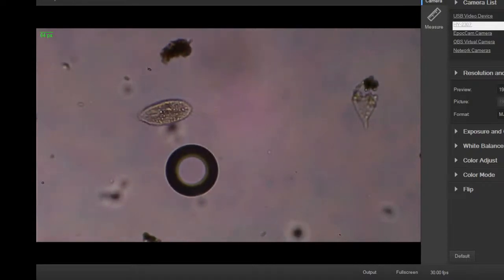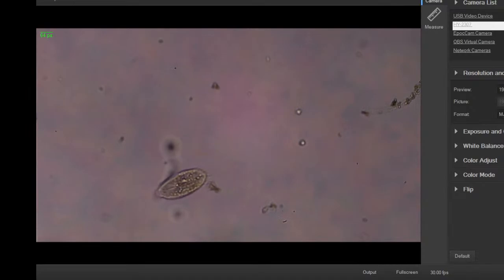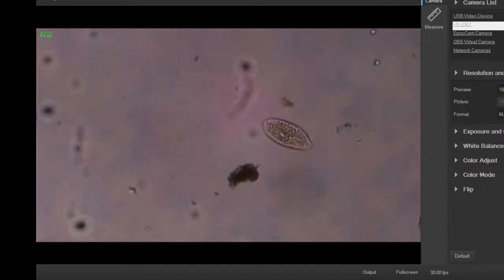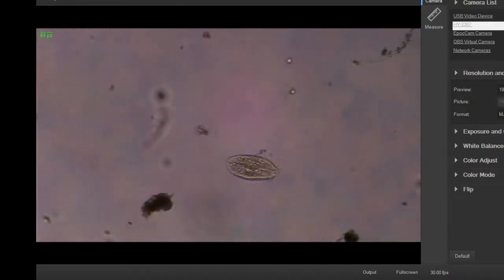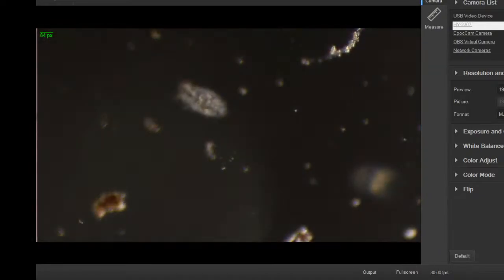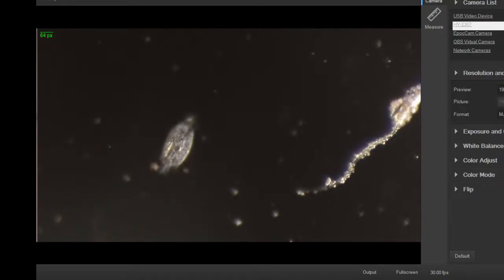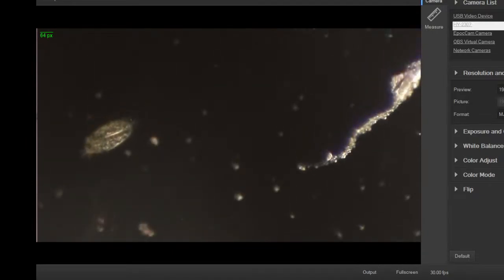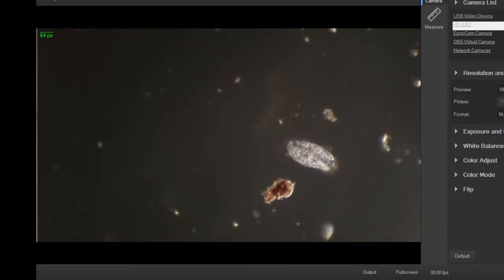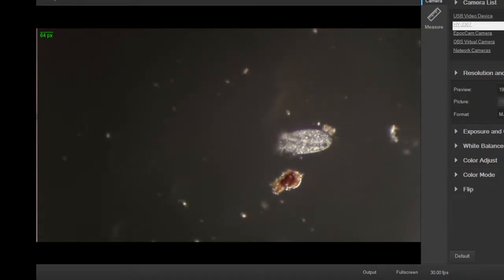Nice air bubble there. Perfectly spherical. I could probably switch this over to a little bit of oblique lighting and get some more detail on this guy. Let's see. Oh, it's dark field. Try that first. That's always nice. Like little jewels in the darkness. Now you can really see the cilia very well, beating furiously.